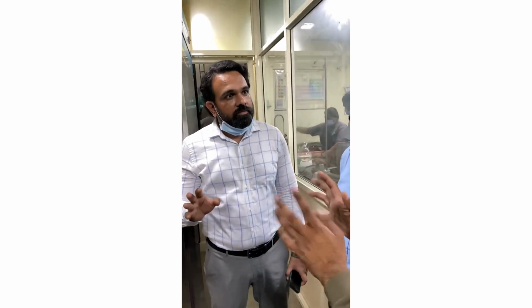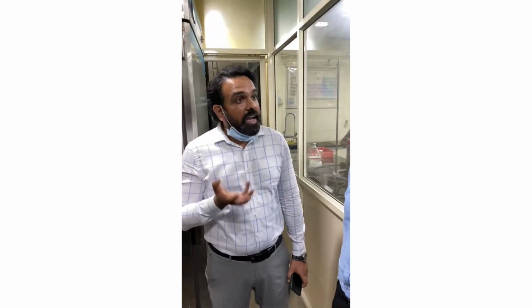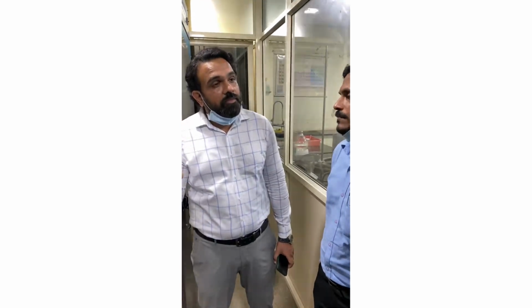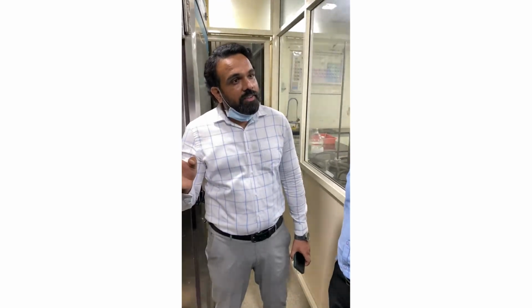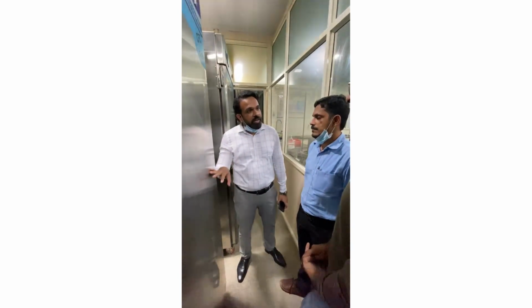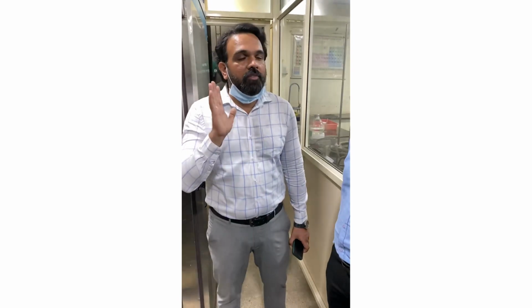These 2 are for the stability study. We will give high temperature and high humidity. High humidity means high moisture content in your air. With humid air and high temperature, we'll see what is the impact on my product, whether my product is stable or not stable. This is the basic fundamental. On that basis we'll define the shelf life or expiry date of my product. These two equipment are meant for that purpose.